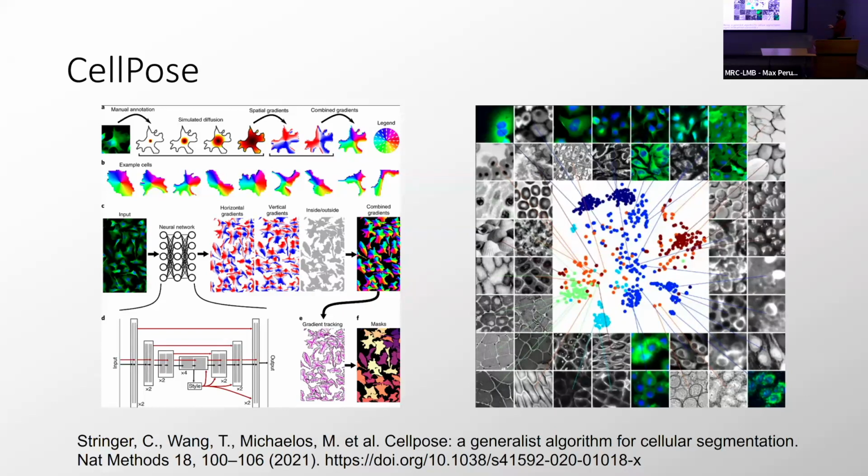Then at the center of the cell, which is defined in various ways, for example the barycenter of the cell, they diffuse the information from the center using a heat equation, and then compute the gradient of this heat equation, vertical and horizontal, which gives you this coding, for example, which gives you a direction where to go. If you are here in the corner, you know how to go to the center if you backtrack it.